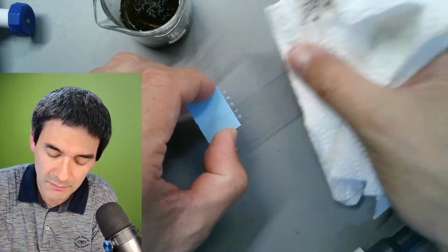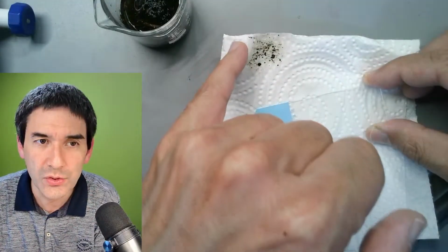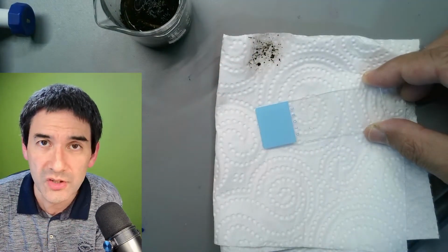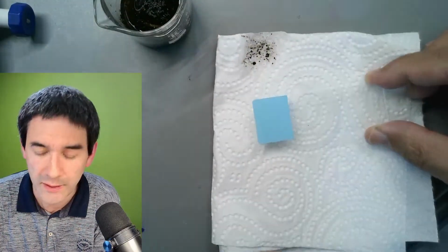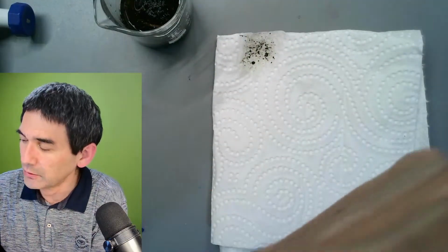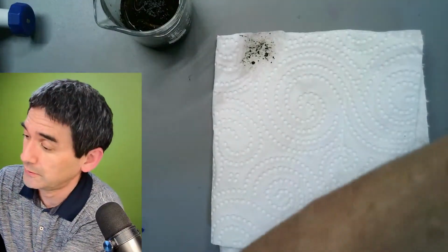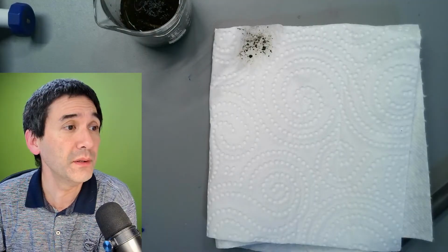And then we're going to simply have a look at what we're able to find here. The reason is, if we leave those soil particles, there's so much of that any microorganisms might be covered up anyway by those. So let's put this on here and let's have a look at what we're able to see, and I will tell you, probably not very much. So don't be disappointed.